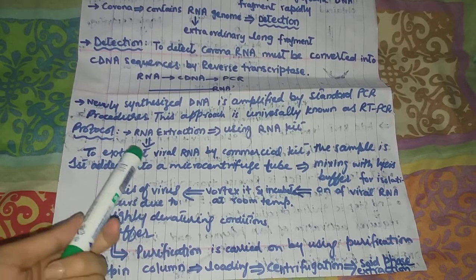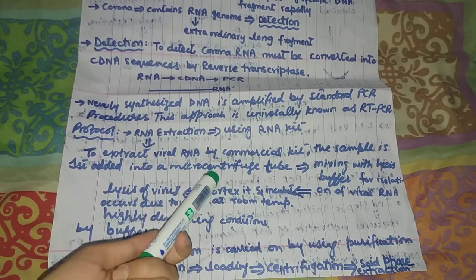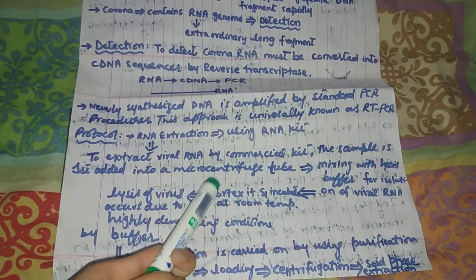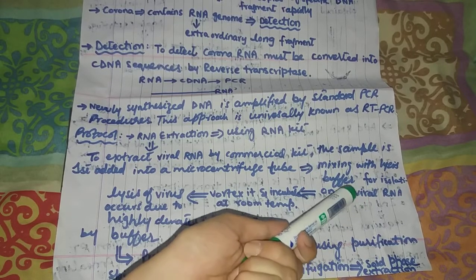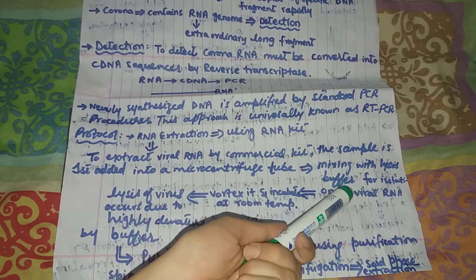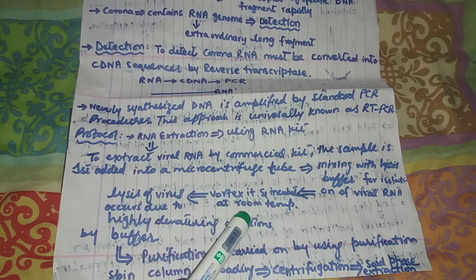To extract viral RNA by a commercial kit, the sample is first added to a microcentrifuge tube. The next step is the addition of a buffer known as lysis buffer. After addition of this lysis buffer, we vortex our microcentrifuge tubes and then incubate at room temperature.